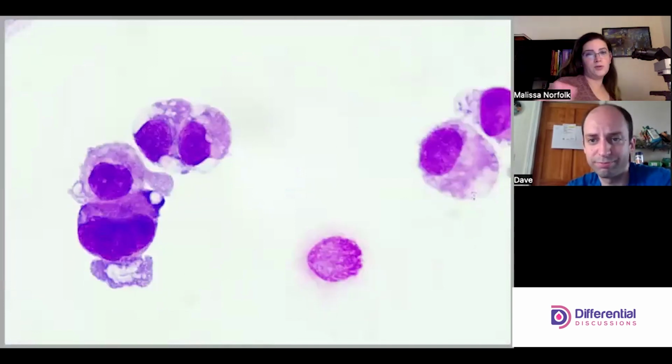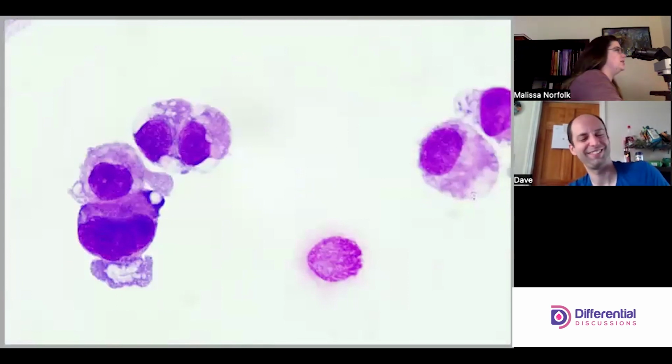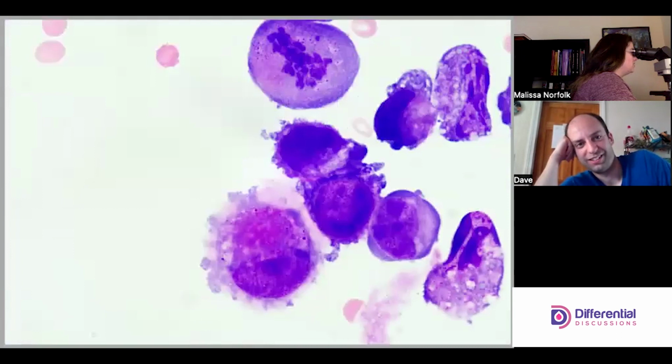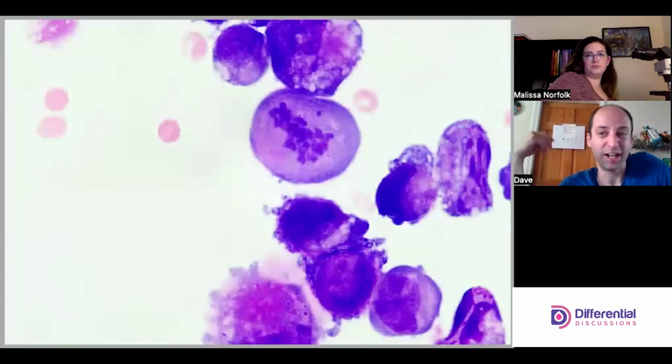I'm perusing around and just seeing cancer cells. I'm just moving around as we're talking, because if we can find something normal, great. But really, it's just these ugly cells, and we keep saying ugly because they are. They're really dark. Oh, look, this guy looks like he's going through mitosis. 1000%.